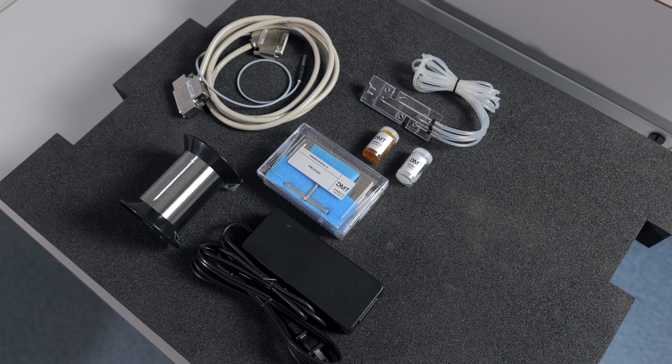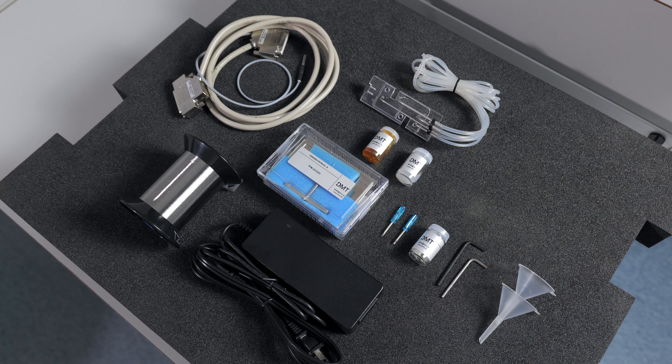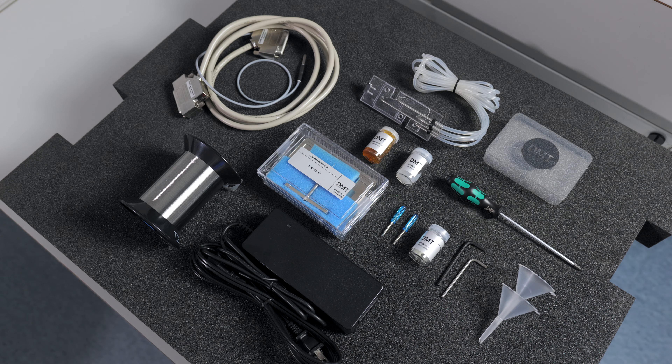40 micron wire for mounting on the jaws. Two kinds of grease for maintaining either the linear slide or protecting the force transducer. Extra screws and screwdrivers. Allen keys for aligning or working with the chamber. Funnels to help with refilling the chambers. A ball end screwdriver. And lastly, a USB stick with software license information and a user guide and user manual.